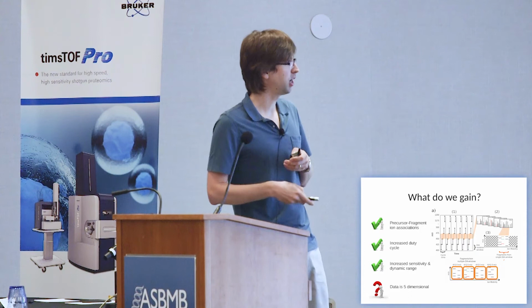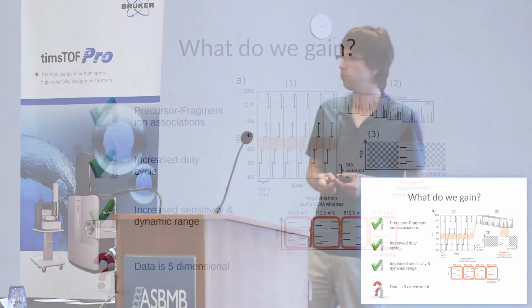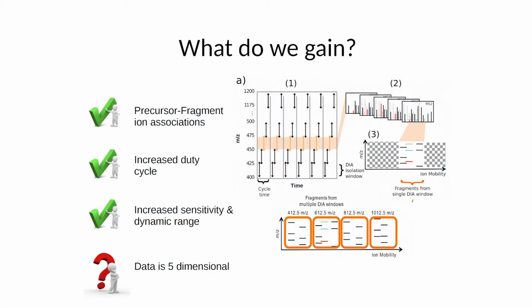Of course, one of the challenges we had to deal with is that the data has now gained an additional dimension on top of the dimensions we already had in our traditional SWATH-MS data.